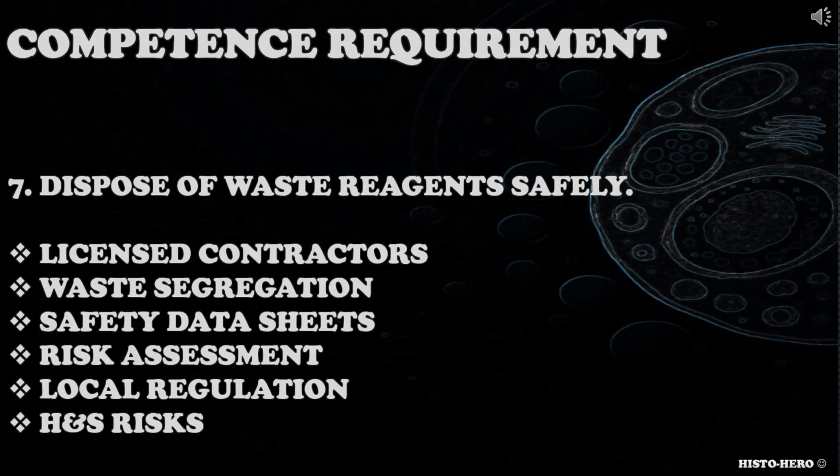When addressing this competence requirement, candidate could consider licensed contractors used by your lab, waste segregation, safety data sheet of reagents that often state disposal ways, risk assessments, local policies, and regulations that are followed, health and safety risks associated with reagents like flammability, corrosivity, environmental toxicity.